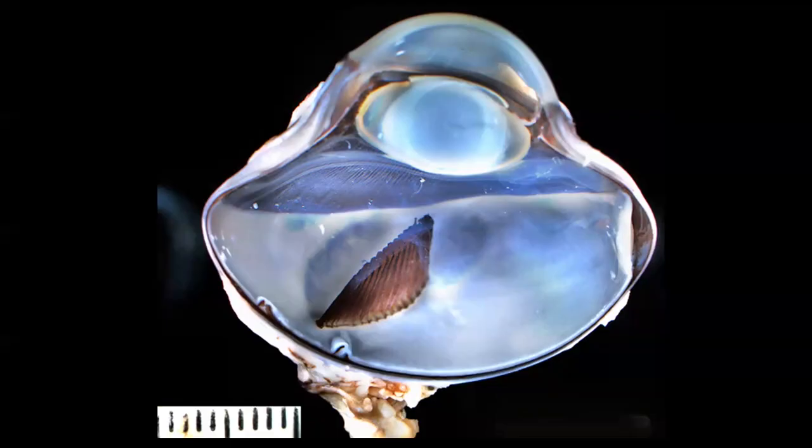I'm not completely sure that the, what's the flightless bird from New Zealand? The kiwi. I'm not completely sure that the kiwi does. I have a kiwi that I'm going to show you. I don't think the section shows the pecten, but stick a pin in it, because the kiwi may not have a pecten.